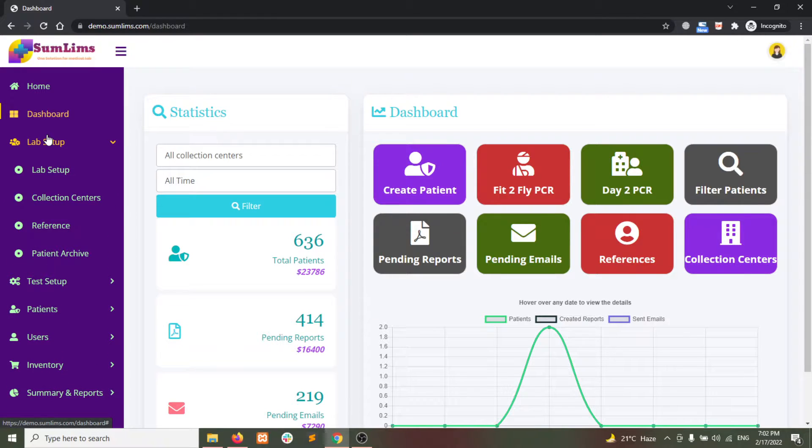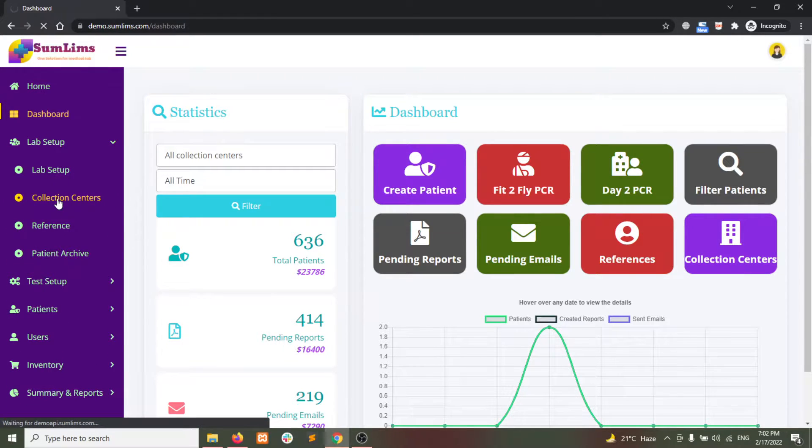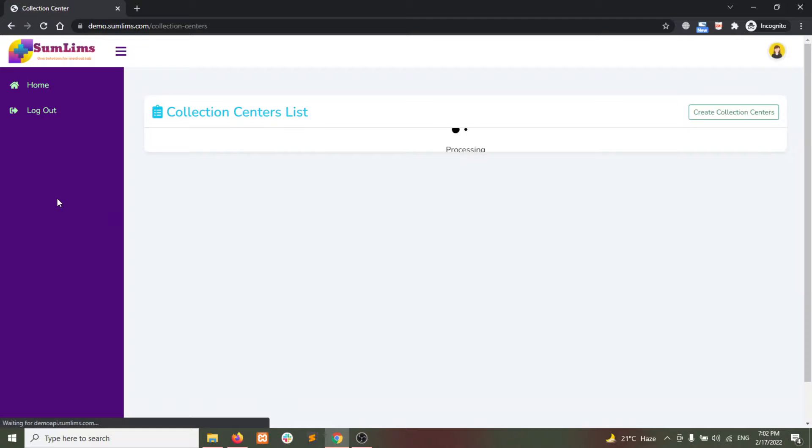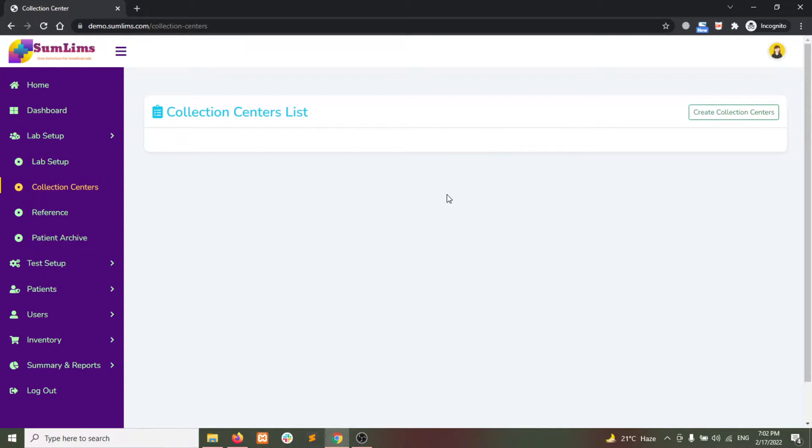From the left sidebar, click on Lab Setup and then go to Collection Centers. You will see the list of all collection centers.